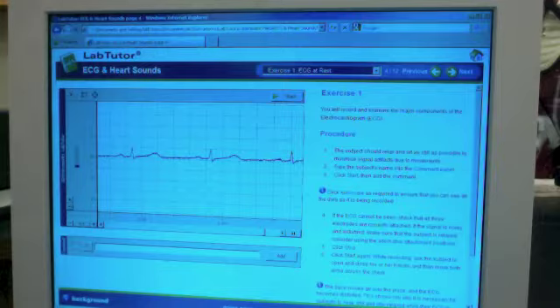It would be like if you were asked to draw a graph in class, and you could set your scales, making them very scrunched up or very spread out. So that's essentially some of the basic things for how you operate this system. And I'm going to go over a little bit how this particular setup is going to go.